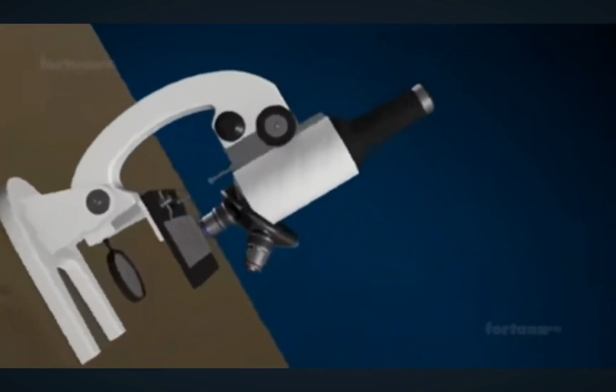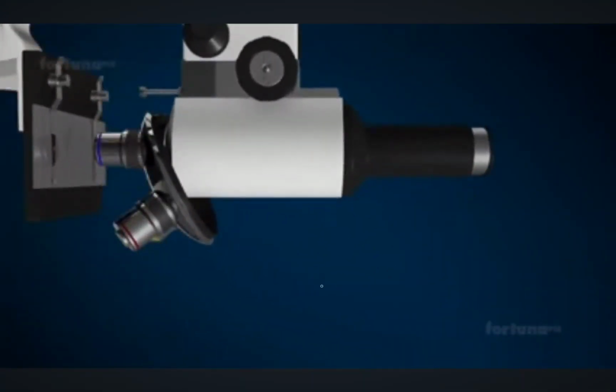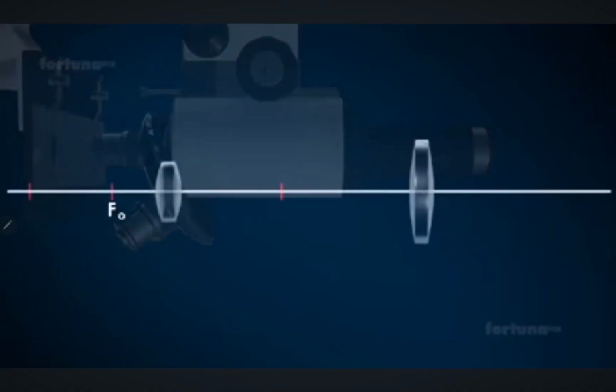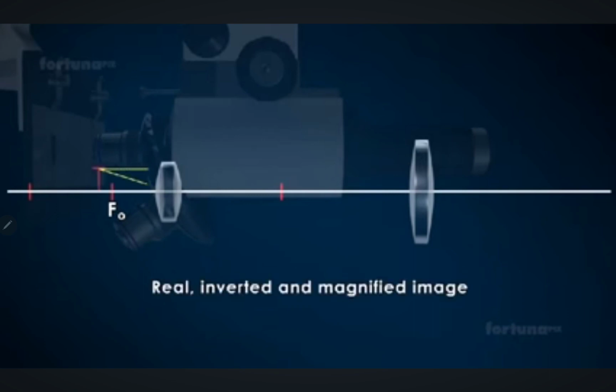Working of the compound microscope. The object O is placed just outside FO, the focus of the objective lens. A real inverted image is formed. This is not for you, this is your physics. You have to study this in bio, this much is enough.